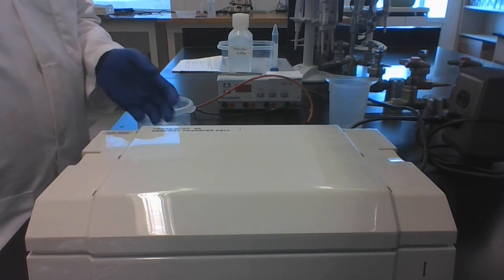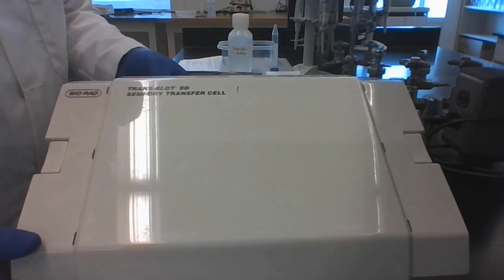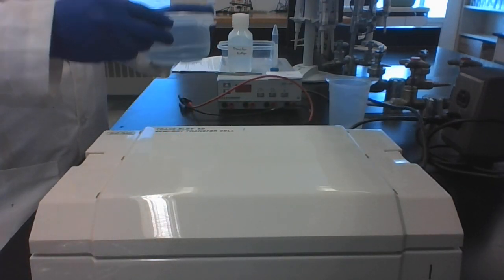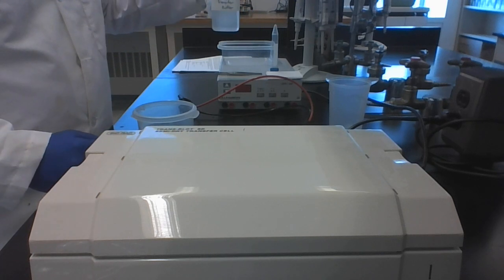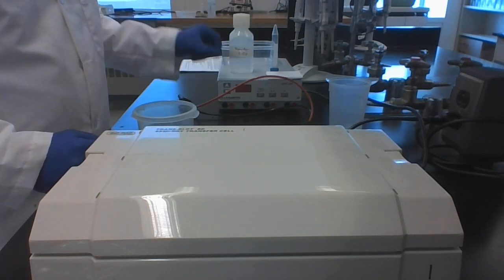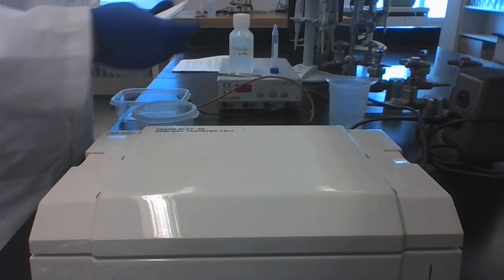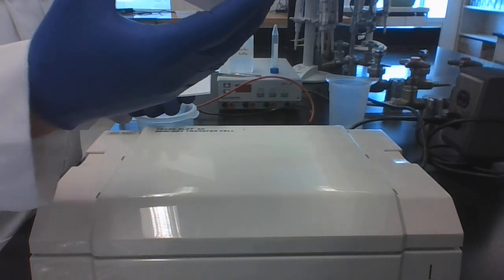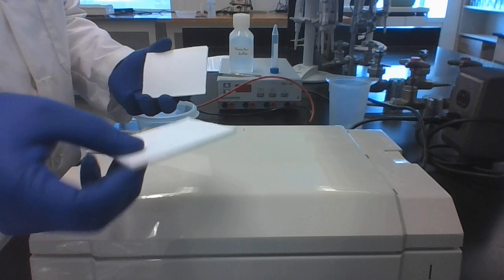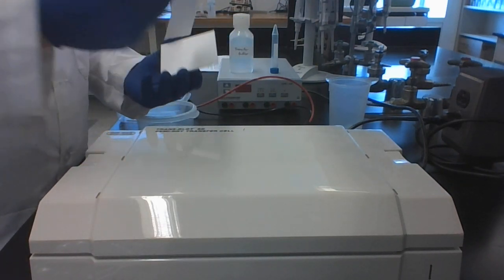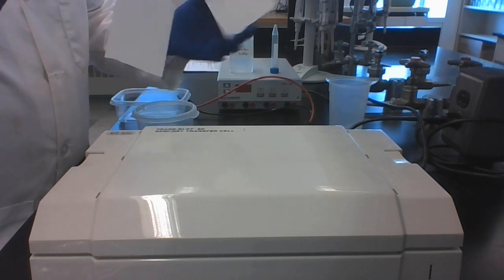So we have a few things. We have our gel, which is soaking in water here. We have transfer buffer, forceps, an extra tray, and then we have some filter paper, our nitrocellulose membrane which is here, and then we have another filter paper.